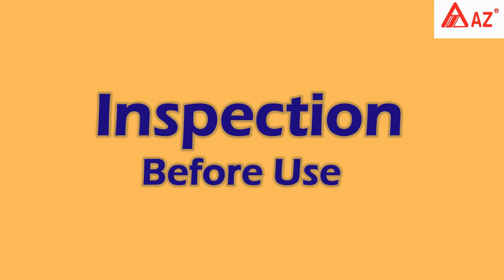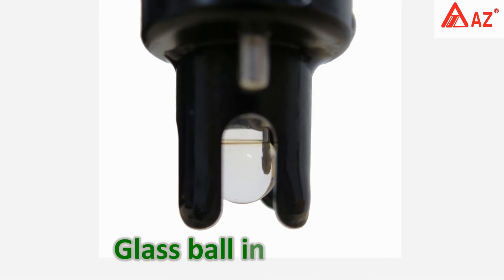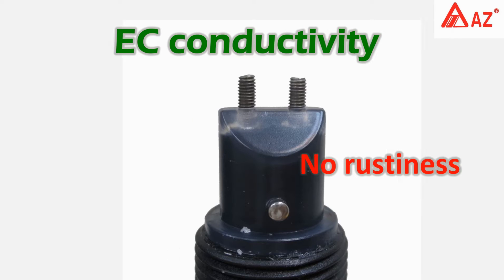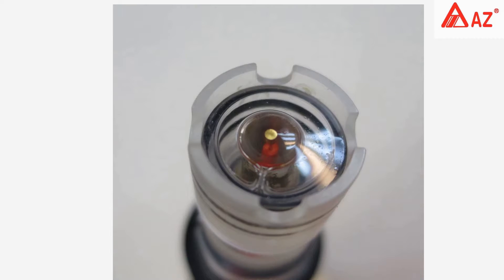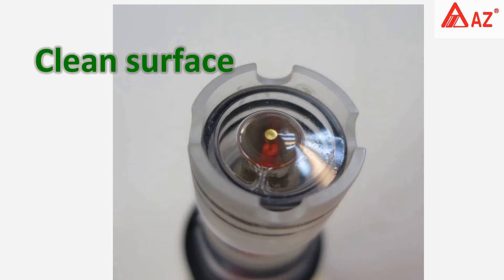Inspection before use: for the pH probe, keep the protective cap on and the moisture glass ball should be in good condition, no rustiness. For the conductivity electrode, it should be easy to conduct. For the dissolved oxygen probe, remove the anti-collision hood — no broken electrode, fit tightly with membrane set, clean surface on electrode working area.